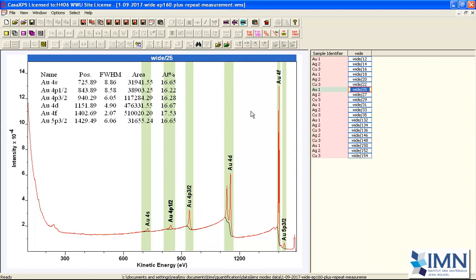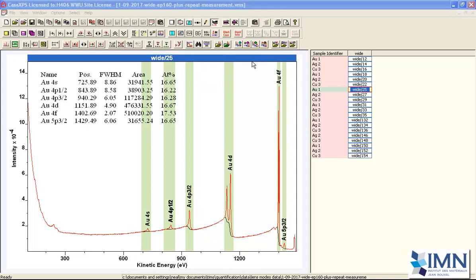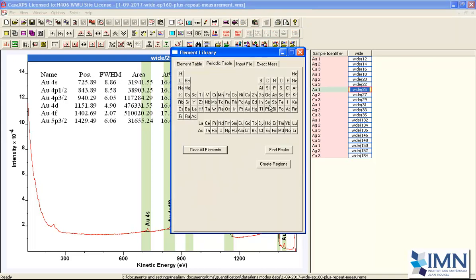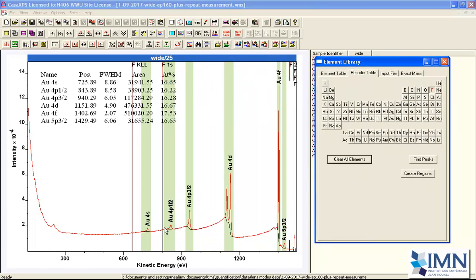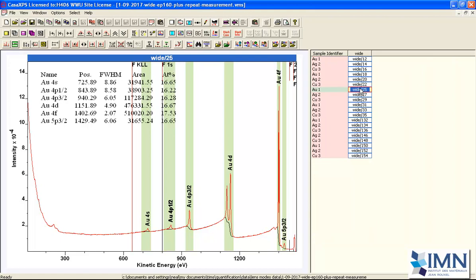of kinetic energies. And this range of kinetic energies is very much the type of range that we're talking about for the fluorine. So if I put up the fluorine markers, you can see that over this range of peaks it's equivalent to what we're looking at with the Fluorine 1s and the Fluorine 2s. So how can we use this? Well, if we've got a spectrum that is behaving as if it has a flat transmission, which is what this appears to be doing, then we can use this to correct other spectra.